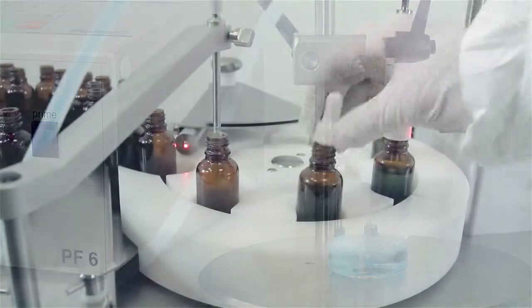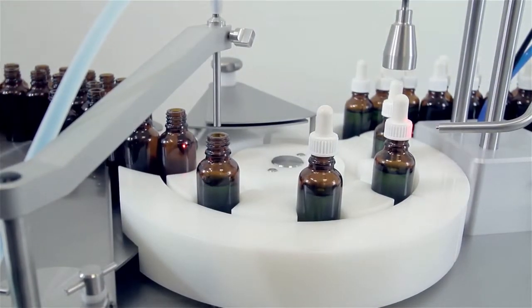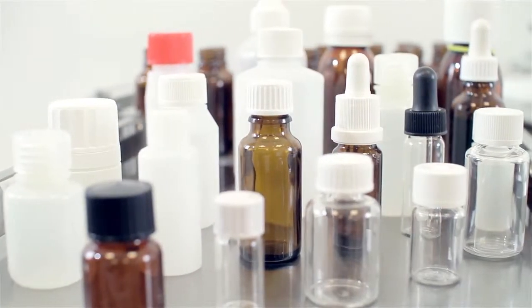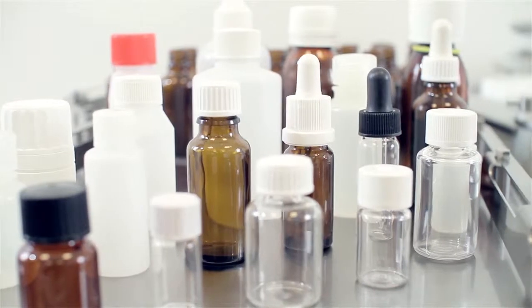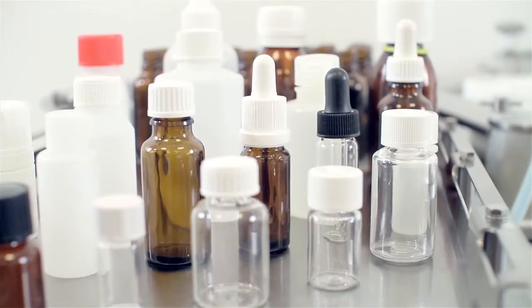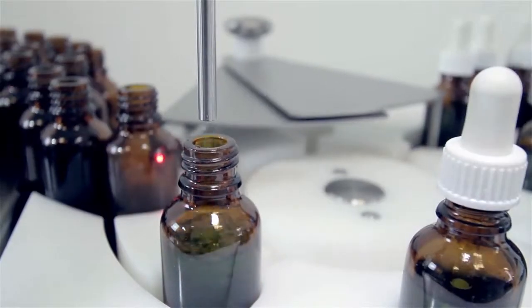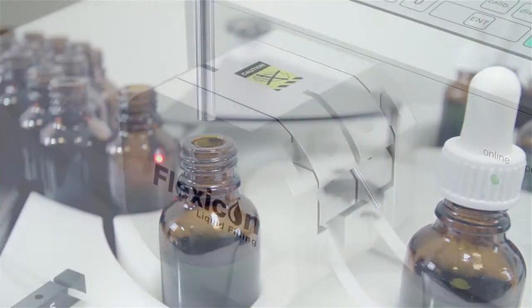The PF6 is able to fill volumes from less than 0.2 milliliters to more than 250 milliliters, and a filling accuracy of plus or minus 0.5% is achievable for most volumes. This unique and consistent filling accuracy prevents costly overfilling and contributes to an excellent return on your investment.